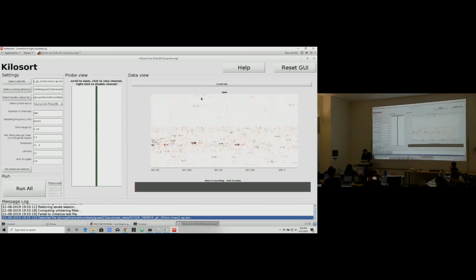Okay, so let's try to find some spikes up at the top. I'm not sure if I'm zooming correctly to the top, but I can try. Okay, so controls will also tell you how to zoom in correctly through these things. So zoom, scale, move. Scroll and Alt, Control, Shift, scroll. Okay. Is that the right file?